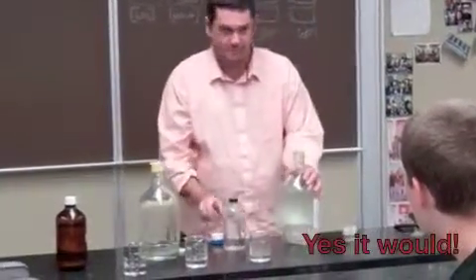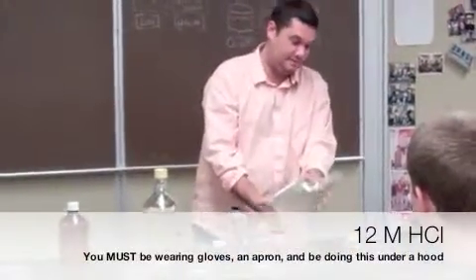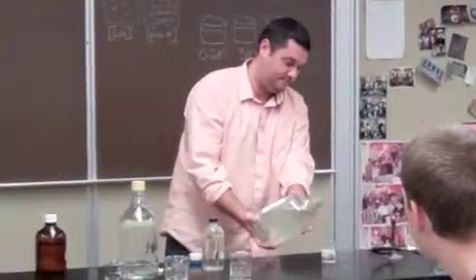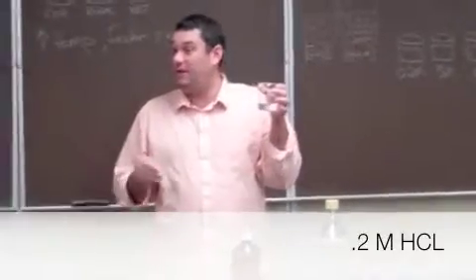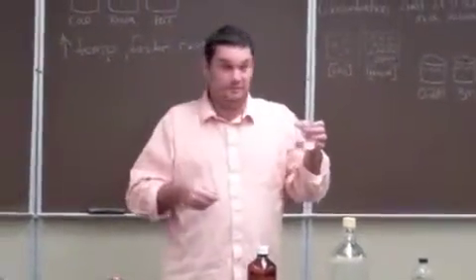Is he joking? No, he's not. Look at it. Everybody see? It's kind of smoking. We don't have to count for this one. I just want you to watch. I also want you to watch for evidence of a chemical reaction.